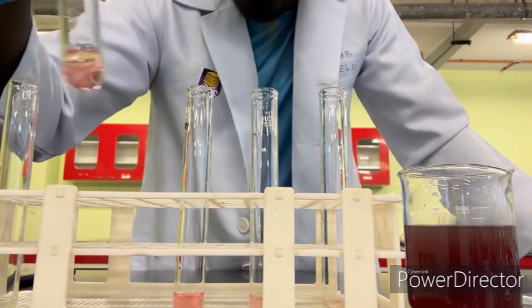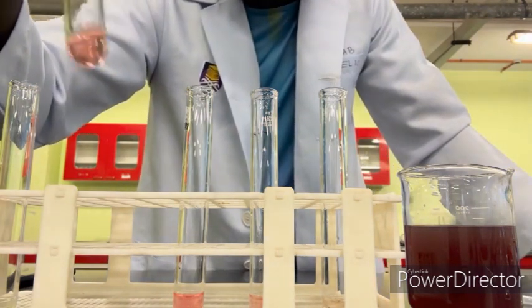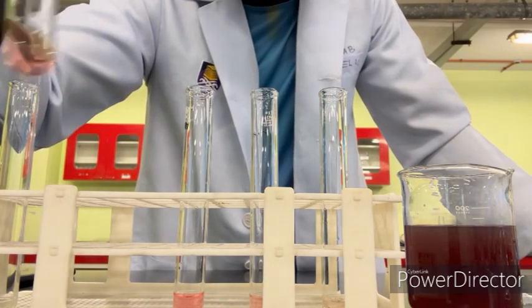These are the color changes for the 1m acetic acid once we added solution.